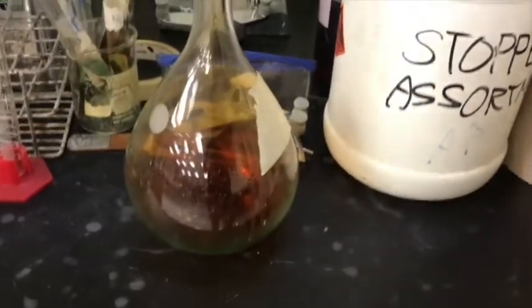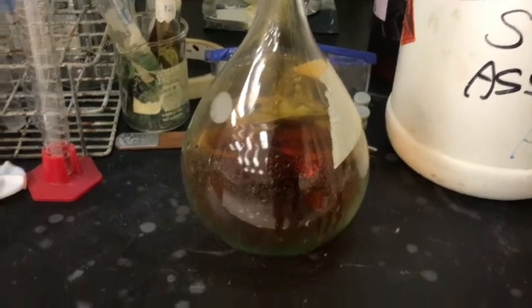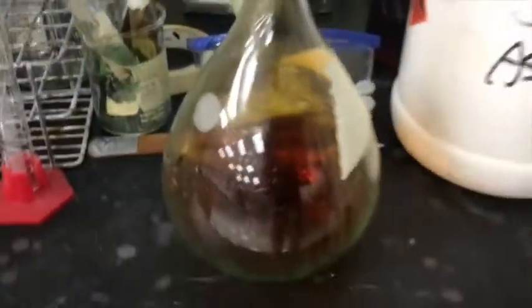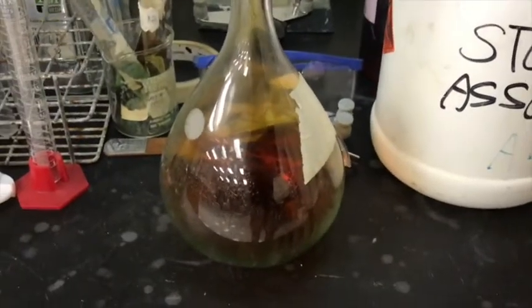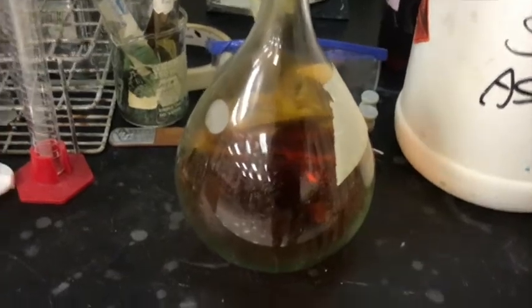So we're going to have to take this whole thing and put it in the fume hood over here and let that dissolve and react overnight. So that guy there is going to sit all night and react. Can you tell that the blue color of the copper ions is already forming down here? So this guy there is going to work all night, and we're going to get rid of that poisonous gas.